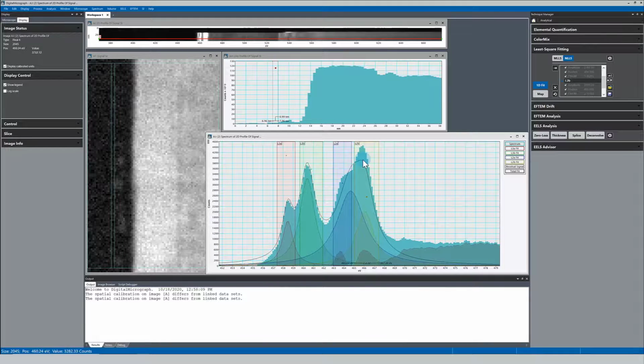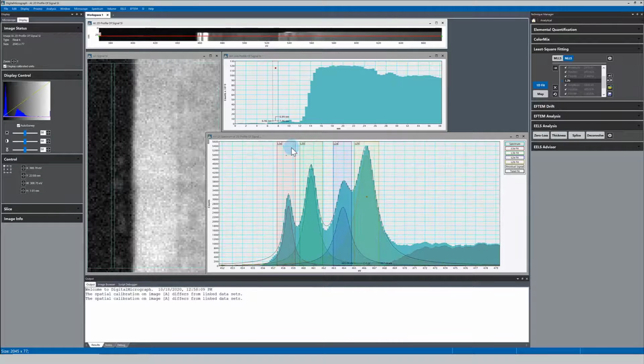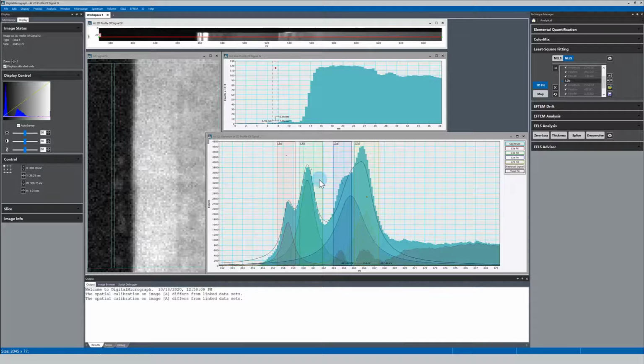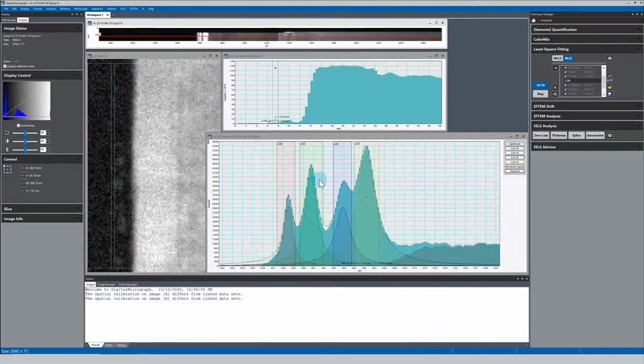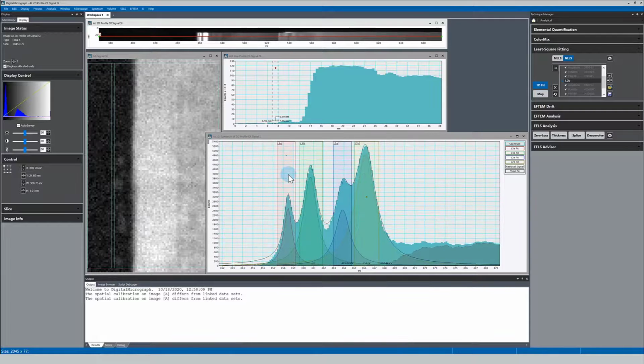So, but yeah, okay, let's just skip over the L2 and use the L3 line. Okay. Yeah, so that's the region I'm interested in. And we get good peak tracking for the L3A and the L3B. So let's just go with that.